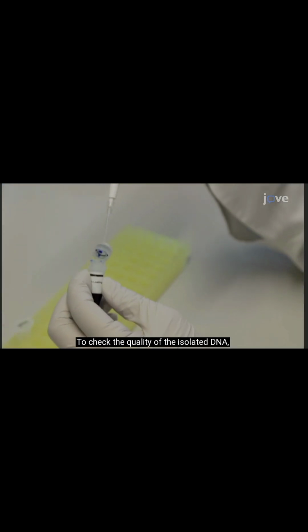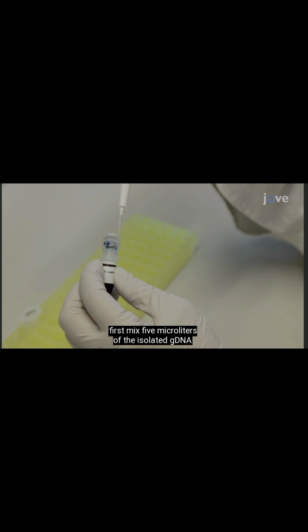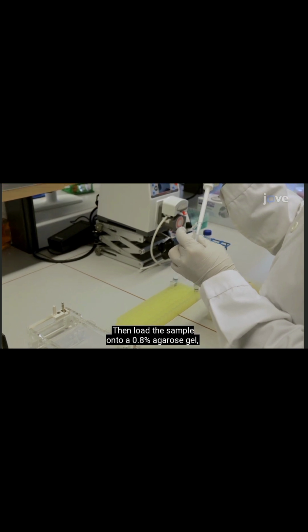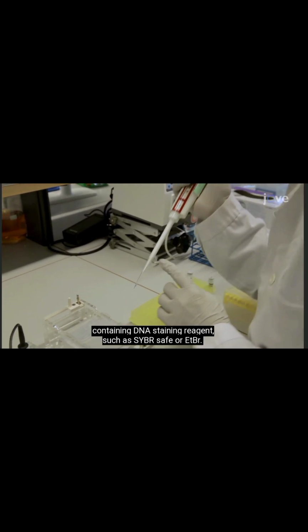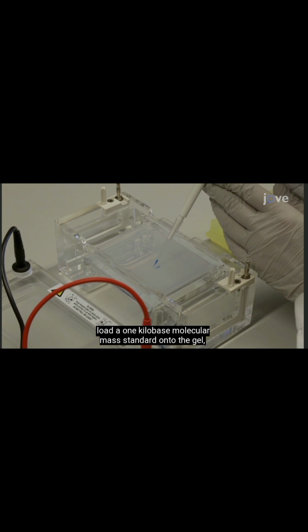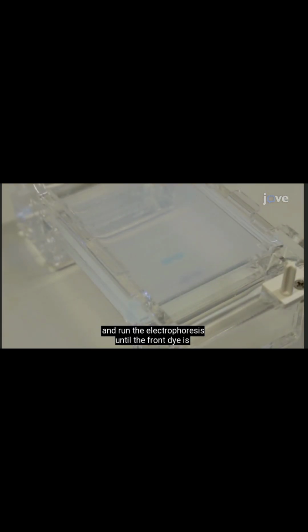To check the quality of the isolated DNA, first mix 5 microliters of the isolated gDNA with 1 microliter of DNA gel loading dye. Then load the sample onto a 0.8% agarose gel containing DNA staining reagent, such as SYBR Safe or EtBr. After this, load a 1 kilobase molecular mass standard onto the gel, and run the electrophoresis until the front dye is approximately 0.5 centimeters from the bottom of the gel.